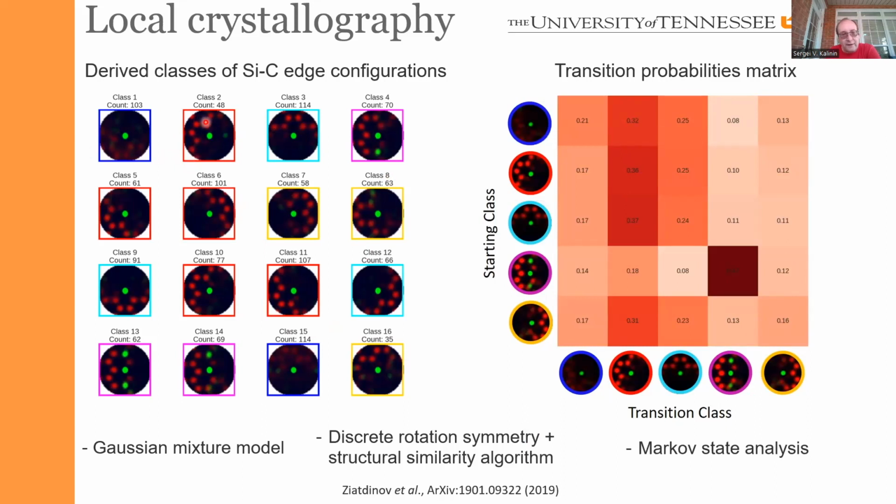So here you can see the armchair edge with the silicon termination. This is the same edge, but with a different orientation. They're rotated by 60 degrees. This is the silicon sitting on the zigzag edge. And then if you go through these components, you can basically see that all of them have physical meaning. This one is particularly beautiful. You see these are 3 carbons and these are 2 silicons.